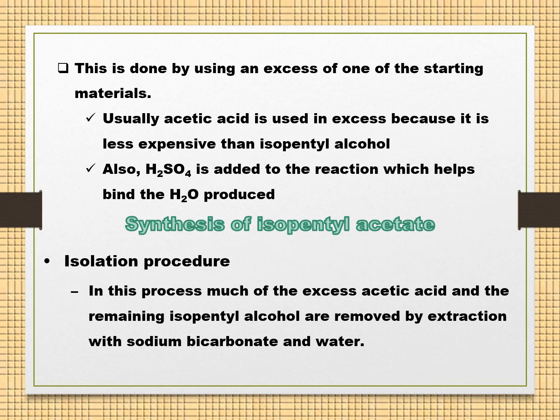In this synthesis, we also add sodium bicarbonate and anhydrous magnesium sulfate. The magnesium sulfate is just a drying agent to dry out the water, but the sodium bicarbonate and water are to wash out any excess alcohol or acid remaining.